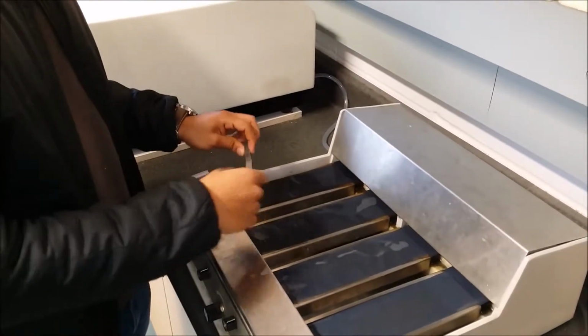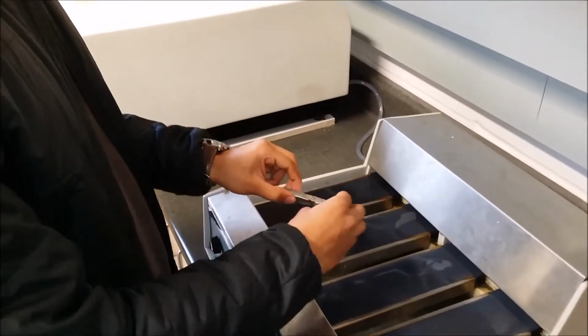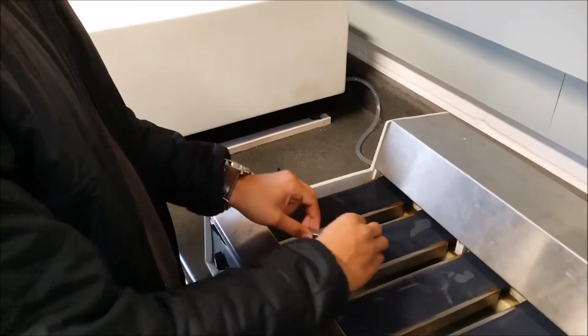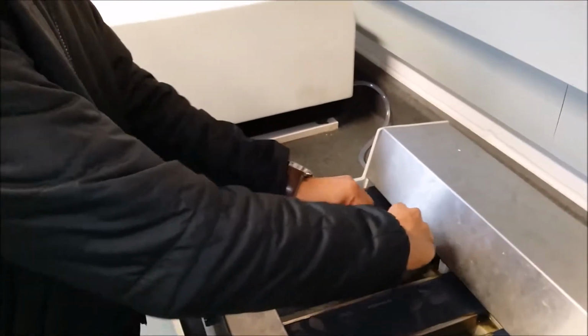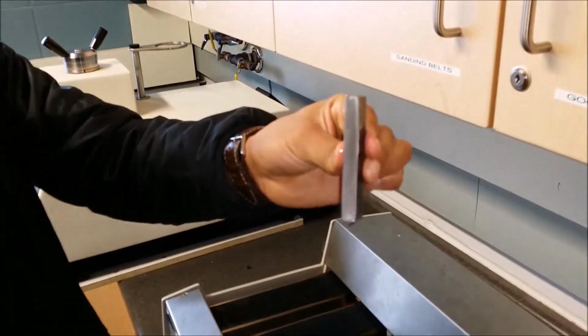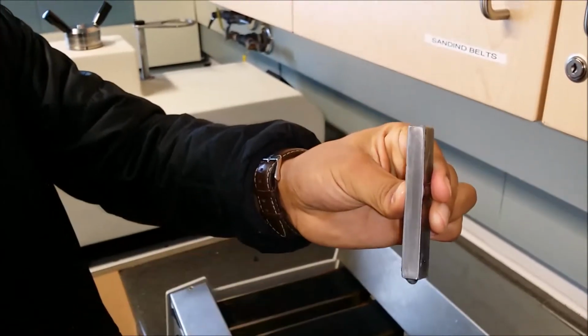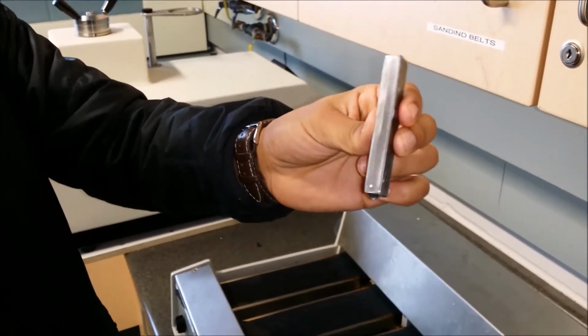When you go to the next sandpaper, you need to tilt the piece of metal perpendicular to the first one, at the other 45 degrees, and do the same process again. As you can see, it's becoming finer. You can see the grooves on the surface, but they will go after the polishing.